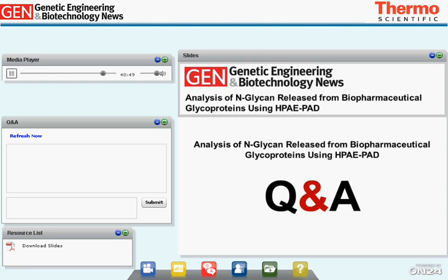And also we are using the 3 mm gold electrode, though we just have to polish the electrode every 3 to 6 months with sandpaper. But for amino acid analysis, we are using disposable electrodes, which are very convenient and ready to use. We just have to build them in and can start the analysis. And amino acid analysis is like an on-demand analysis at Glycothera.